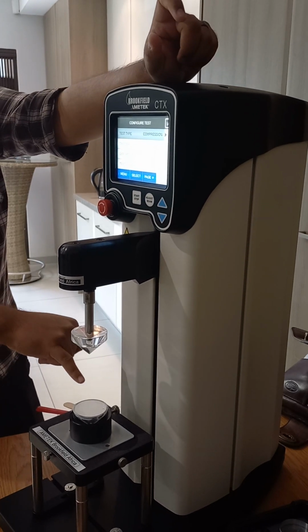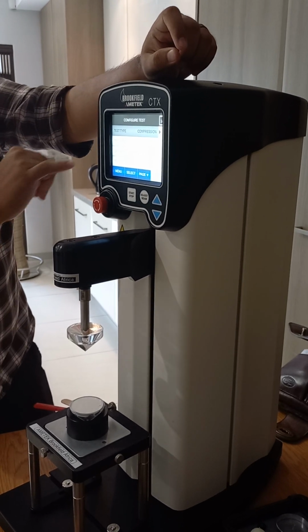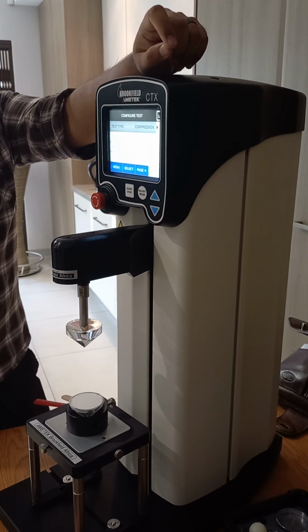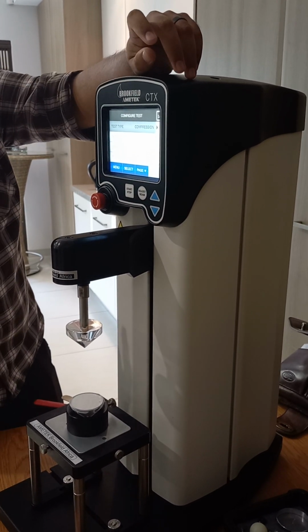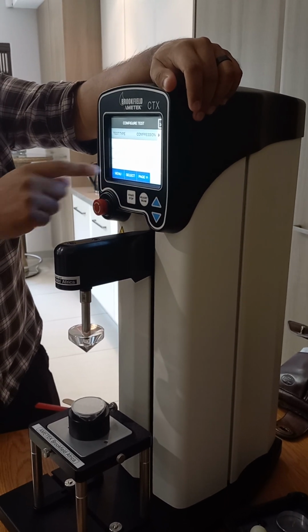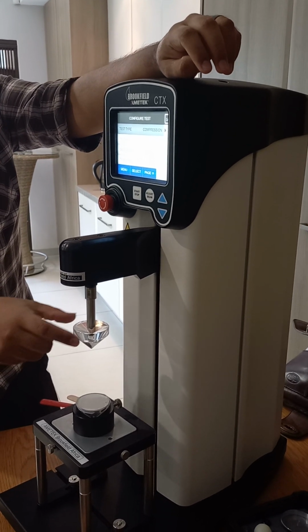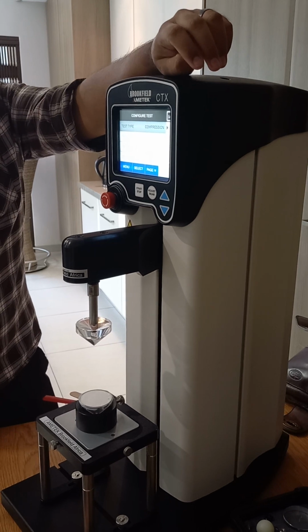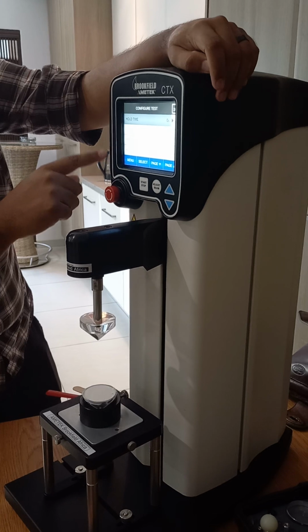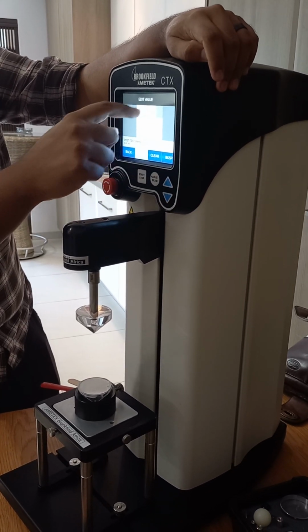So it'll touch the edge, get that 2 gram force value, then move 15 millimeters into your sample, and then it'll come out. So deformation 15 millimeters, test speed 2 millimeters per second. What that means is that per second, this probe will move downwards 2 millimeters. I just need to change something here. Post-test value will also make that 2 millimeters.